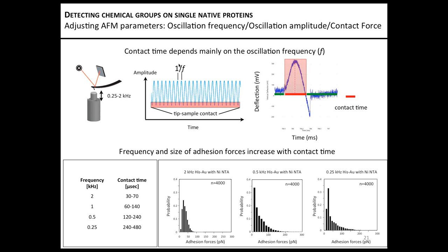The next question is, does the surface roughness affect the force profile? Do we need a flat surface to obtain the data like you showed us today? Well, basically, it depends on how fast the system reacts to the changes in the topography. In my case, we are scanning at half a kilohertz. This means I'm scanning at a really low scanning rate, so this gives me no big trouble overcoming big topographical obstacles.